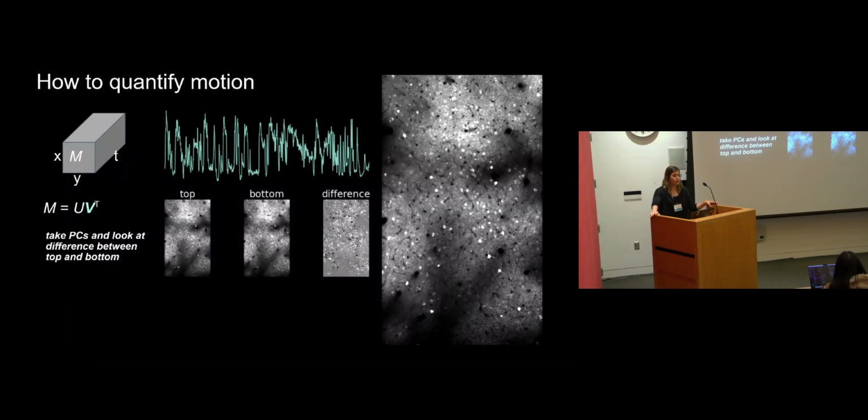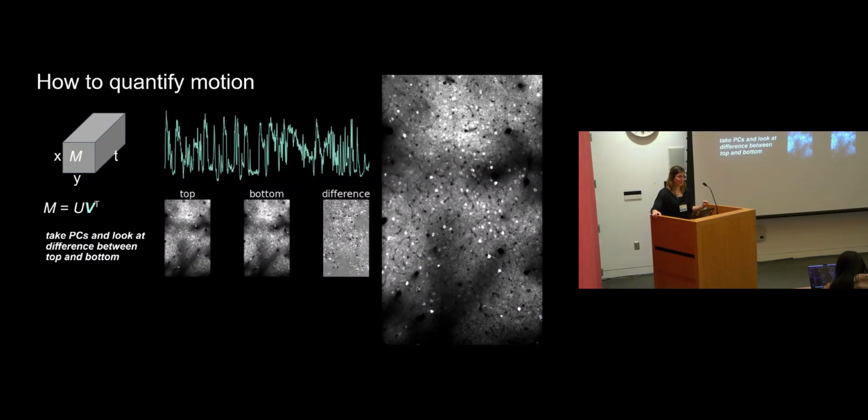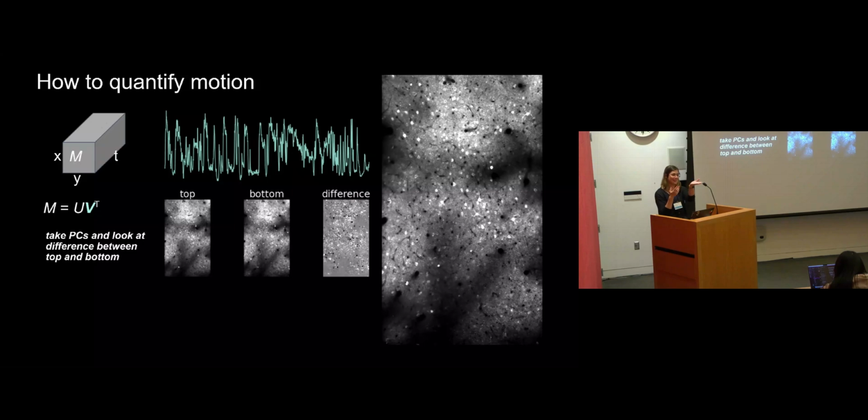Oh, yeah, no, sorry, we're not correcting Z movement. This is just diagnosing it. There's no good way to correct Z motion if you only collect one plane, and people should not tell you otherwise, because your cell could basically completely move out of the field of view, exactly like you're saying.